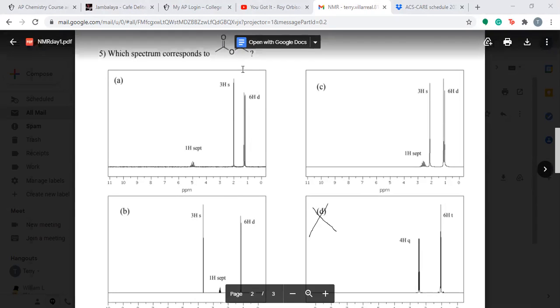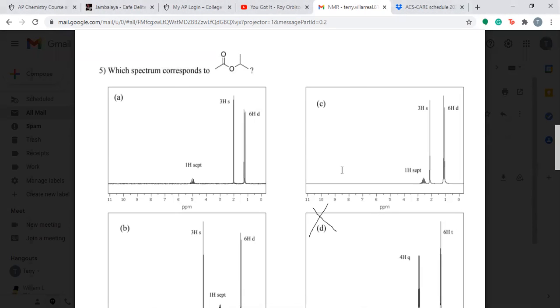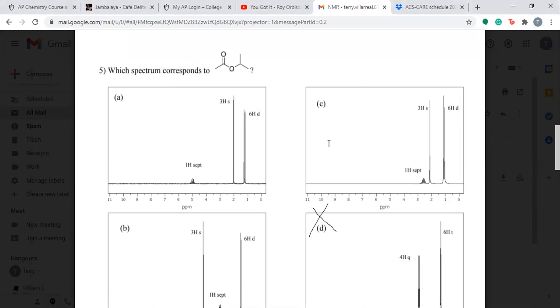So now we have here this wonderful little thing that is connected. On one side, we have this attached to the oxygen. On this side, we have it attached to the carbonyl. Which peak should be further downfield? The septuplet peak? Yeah. Okay, so you can eliminate B. All right, so now we have A and C. Which one is it most likely going to be? A. A, because when we go next to an oxygen, particularly carbonyl, it pulls, like an ester, it pulls us downfield.